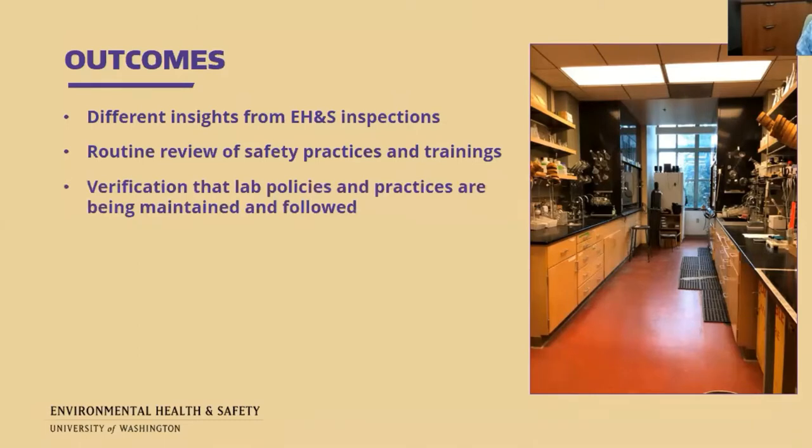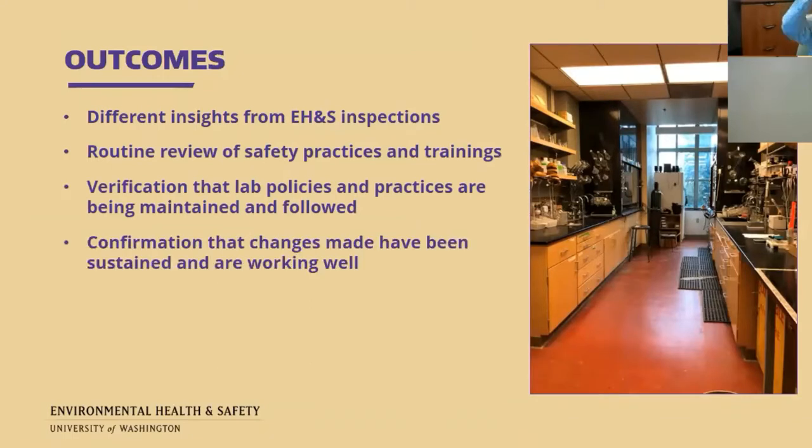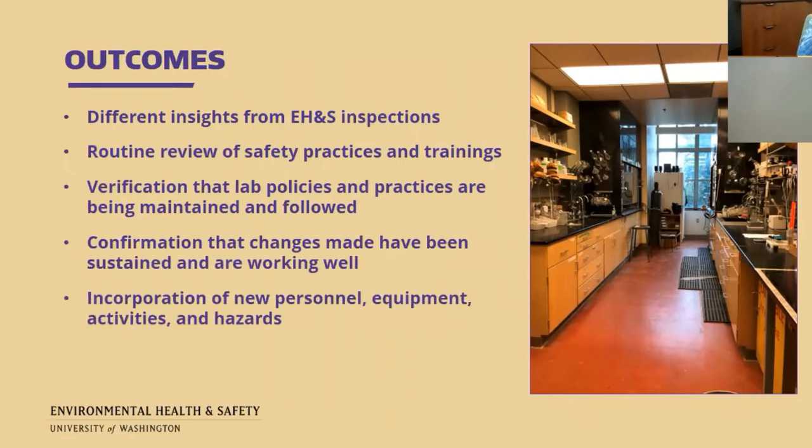They're also an opportunity to verify that lab policies and practices are being maintained and followed. They give you a chance to confirm that changes you've made to your policies or practices are being sustained and are working well for you. And they're also a chance to incorporate any new personnel, equipment, activities, or hazards into your documents, trainings, and practices.